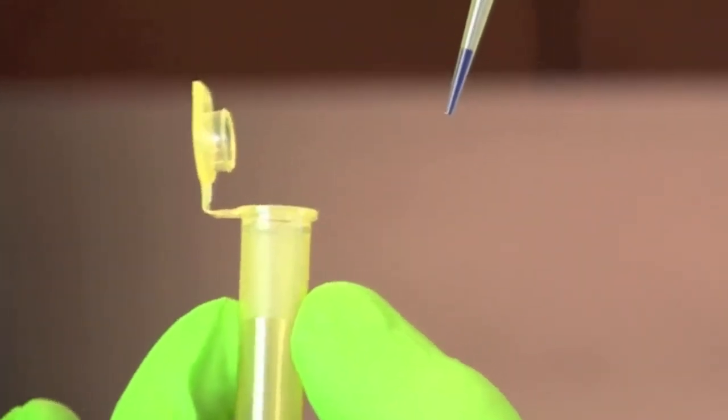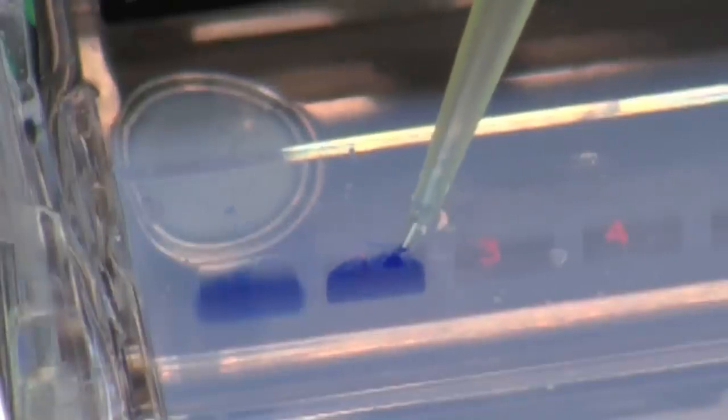When loading the samples, keep the pipette tip perpendicular to the row of wells. This will reduce the risk of accidentally puncturing the wells with the tip. Lower the tip of the pipette until it breaks the surface of the buffer and is located just above or just inside the well.